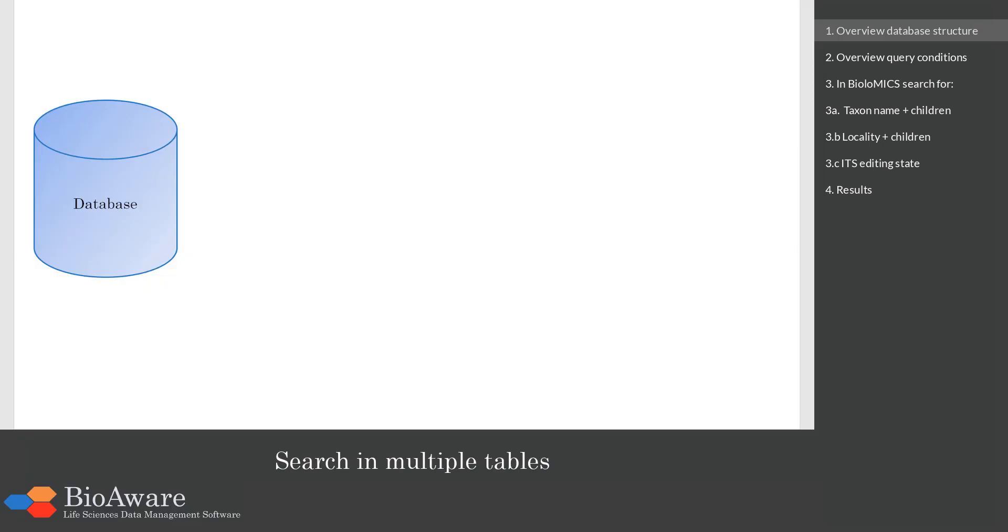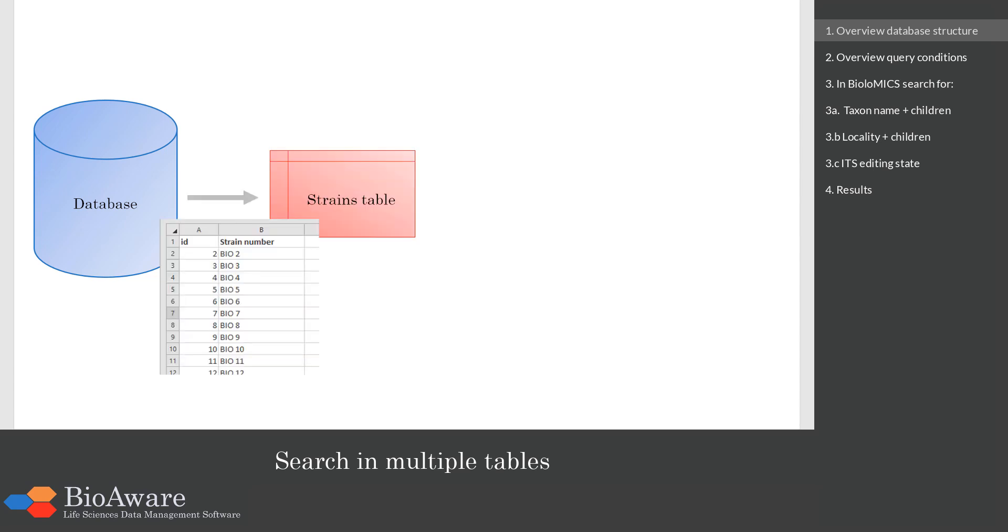First I will give an overview of this movie. Here we see that we have a database. In the database there are multiple tables that are connected to each other. Here we can see that we have the strain table with a list of strains.